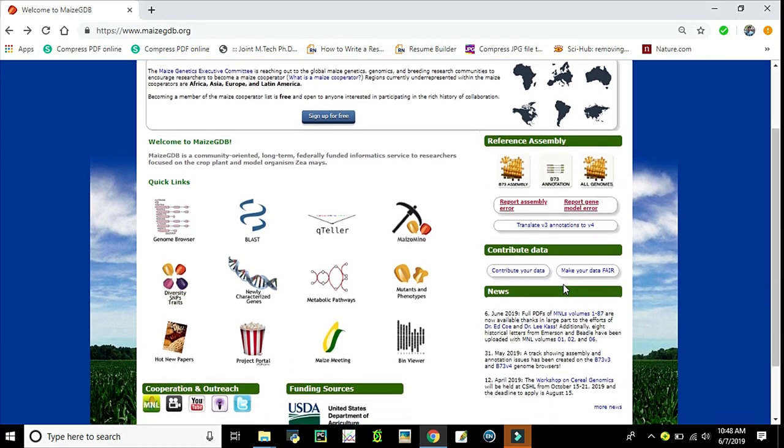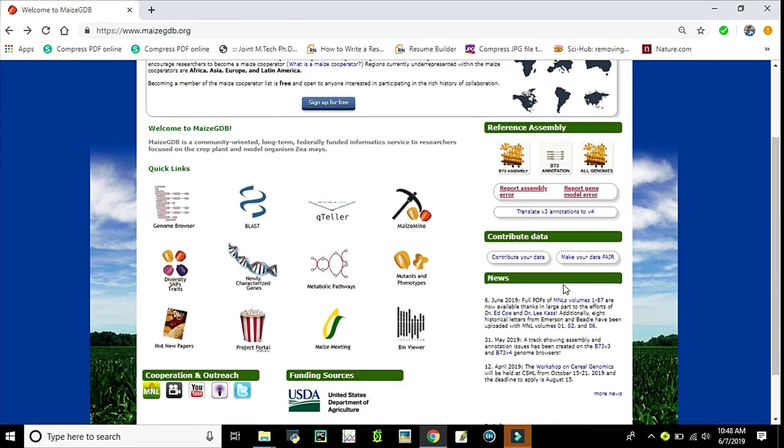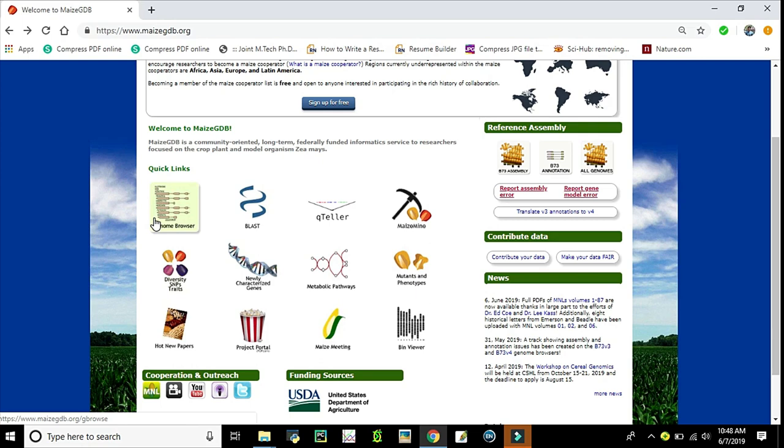We'll see different resources present in MaizeGDB. Let's discuss the quick links given here. The genome browser has the B73 reference genome that was released in 2009 and had several updates after that. Next, BLAST is a tool in MaizeGDB which is useful for finding homologous sequences with your query sequence of up to 35,000 base pairs in total length.